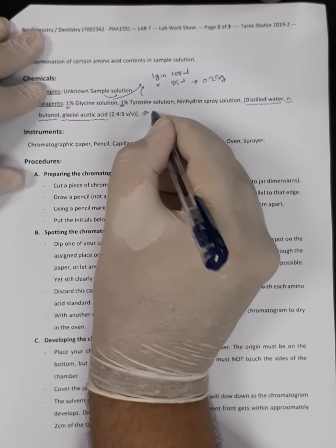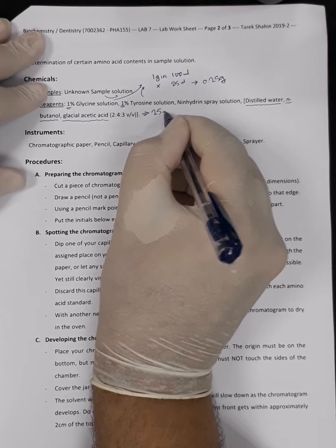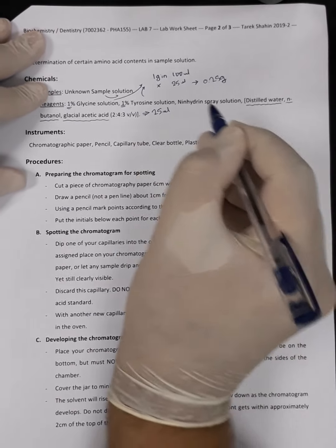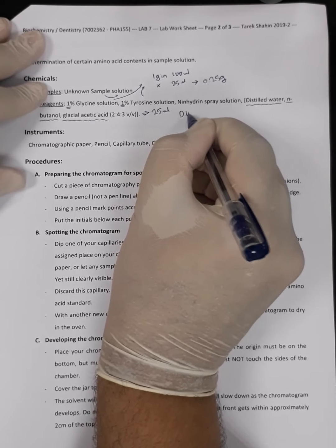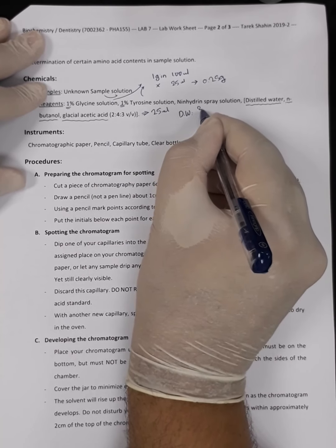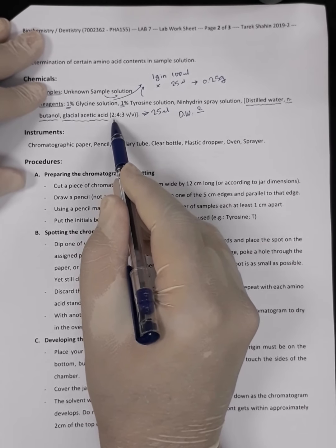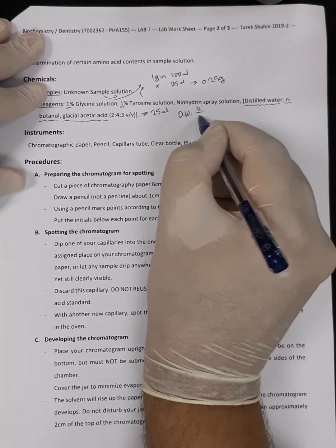Okay, how do we get that? I'm going to ask you to prepare 25 ml of that mixture. First of all, for the distilled water, the portion is only 2 parts. We will divide it by the total number of parts, which is 2 plus 4 plus 3, which is 9.